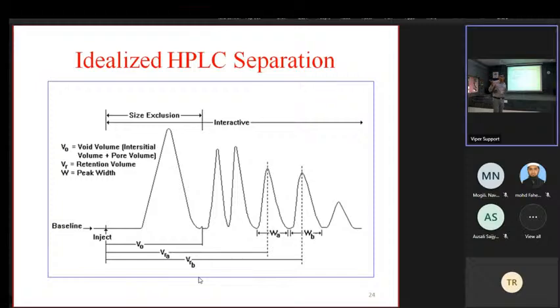You are talking about the procedure of some HPLC technique. There is a calibration, and calibrations have different routes. One technique where you can see a carryover effect is, for example, affinity chromatography.